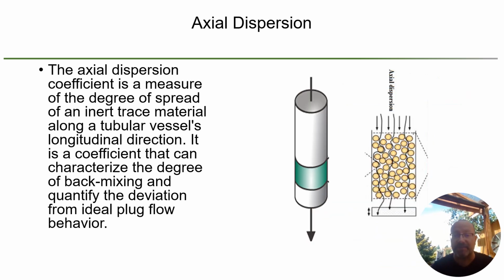So axial dispersion, it's basically the movement through the column and all of the beads of the column. And what happens is when we put pressure into the column and we're moving our analyte or protein through this column, eddies can be created. So we're pushing fluid here, but you can get this swirling effect called an eddy. Like if anybody's ever been out to the ocean and seen how waves crash on the beach and small eddies form, it's the same exact process in fluid dynamics on a liquid chromatography column. So that is essentially the description of axial dispersion.